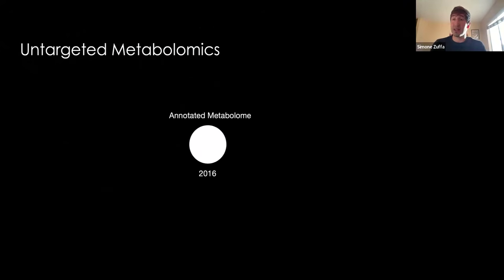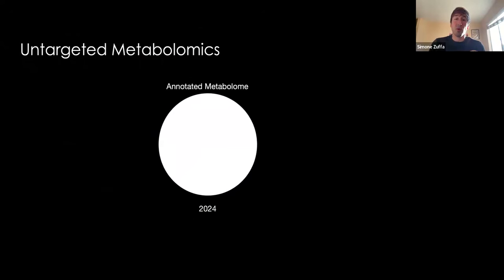The annotation rate that we are able to obtain from the MS/MS that we are acquiring is increasing through the years. But what is very interesting is that within these annotated molecules or MS/MS spectra, just a very tiny fraction is exclusively of microbial origin.